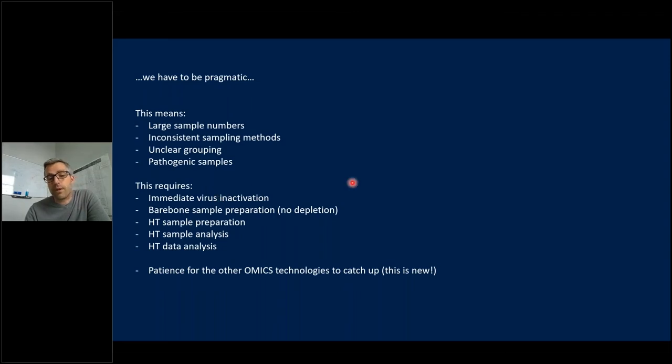There were some preliminary studies where we could use IPA to inactivate the virus, and this is ultimately what we had done, and that basically precipitates the proteins right out of the sample. So there was no way of doing any kind of depletion or even doing sophisticated proteomics sample preparation as you would expect, using DTT and iodoacetamide, for example, to alkylate your cysteine. So that was all not really feasible.